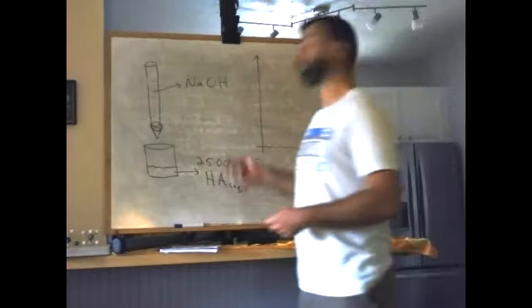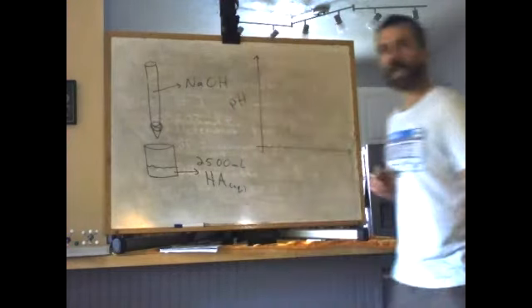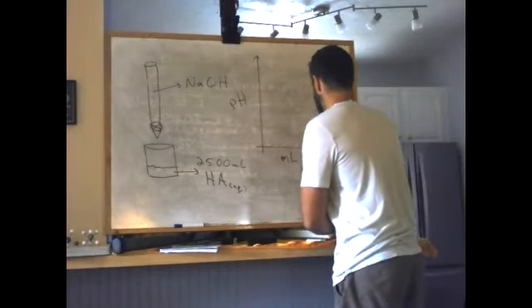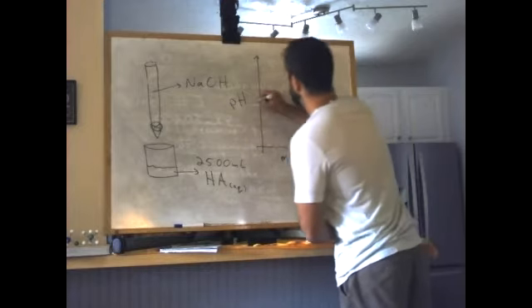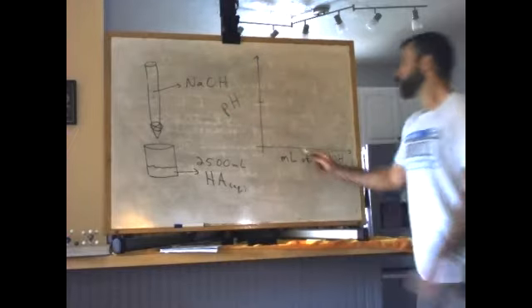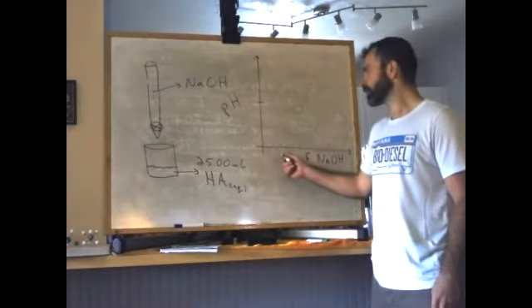So for each of our 2 runs, there are 2 trials in this experiment, you're going to make a plot of pH on your y-axis versus the volume of NaOH added. So milliliters of NaOH added. Okay. I'm going to move this over a little bit. pH versus volume of titrant added. Okay. So what happens? Let's relate this to your lecture and what you're doing in lecture involving titrations.